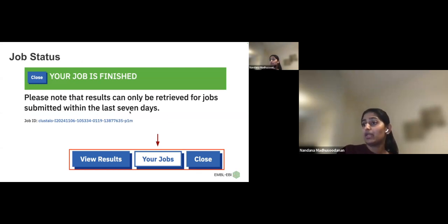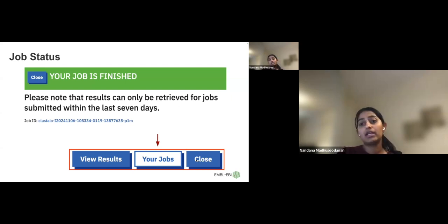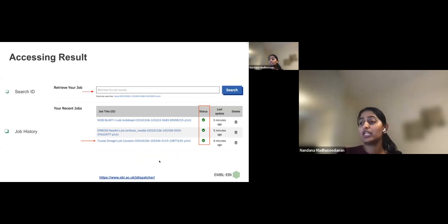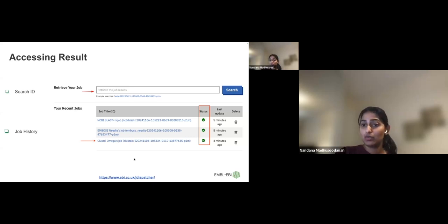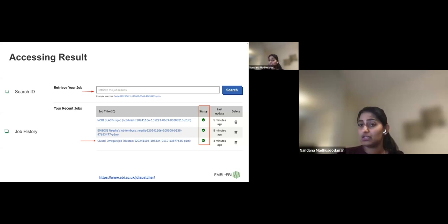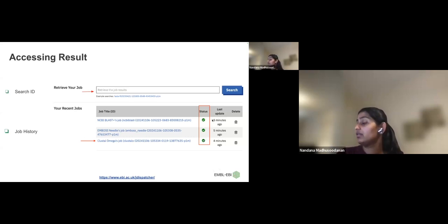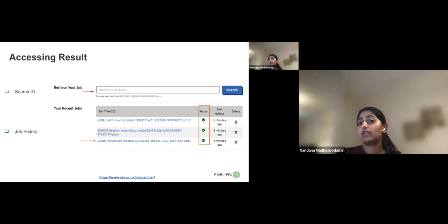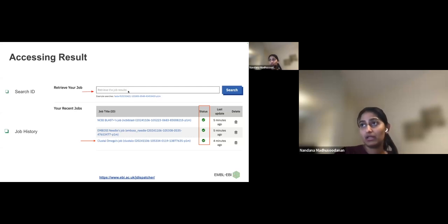Once your job is finished, click 'View Results' and the results will be displayed. You can also click 'Your Jobs' to go to the Job Dispatcher homepage where you can see recently submitted jobs, their status — finished, or an error indicator — and when they were submitted. You can delete jobs from this view, but even if you delete a job, you can still access it within the seven-day window by searching the job ID.